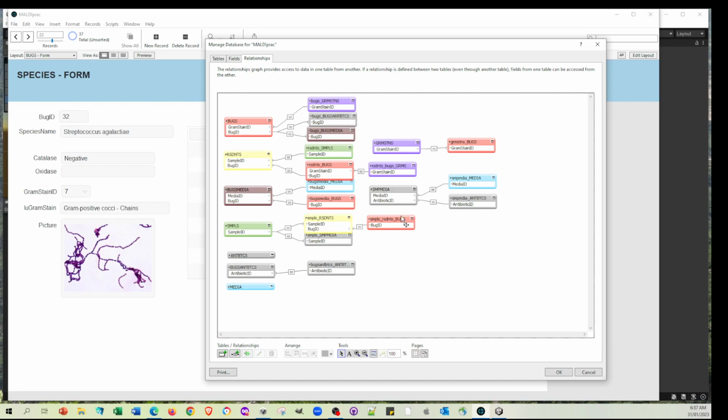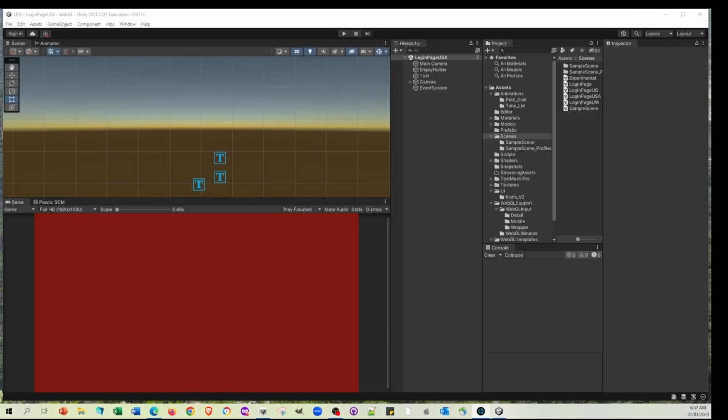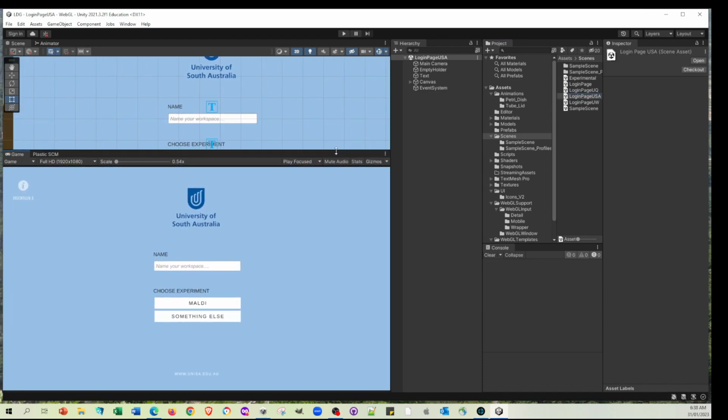All sorts of things are brought together and interrelated so that basically you have incredible freedom to design completely novel samples, which is a fantastic bonus, but it's also the platform on which the Unity piece is driven as well. So the Unity piece understands what it needs to do on any particular sample from that database.